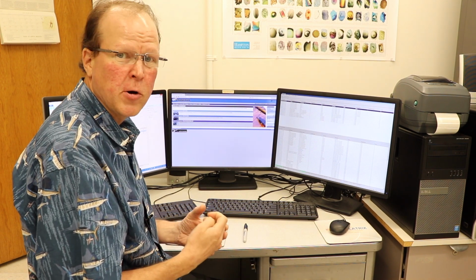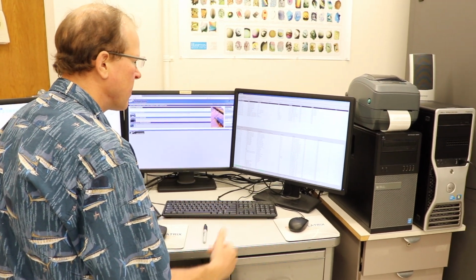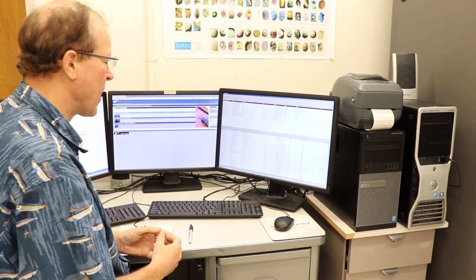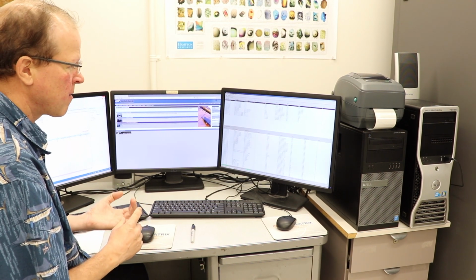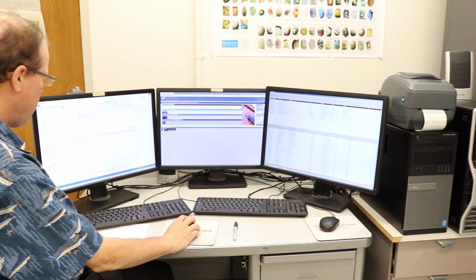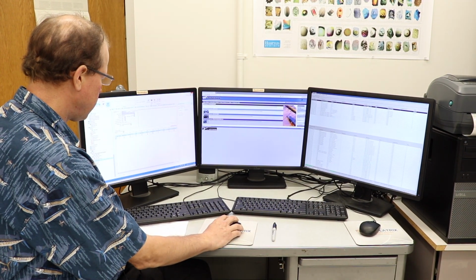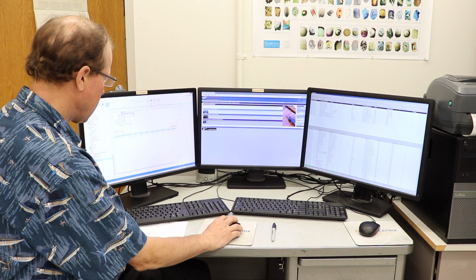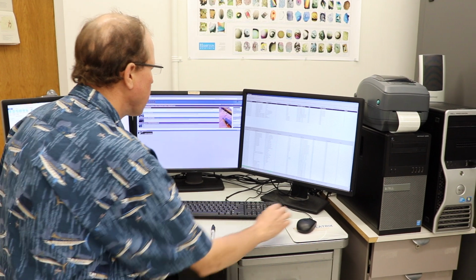And that's based on your protein concentration and your degree of fluorescent labeling. And it's empirically the only way to do that. There is a way to store your settings, and over in RockImager you can have multiple FRAP methods set up. But for now, we're just going to do it manually.